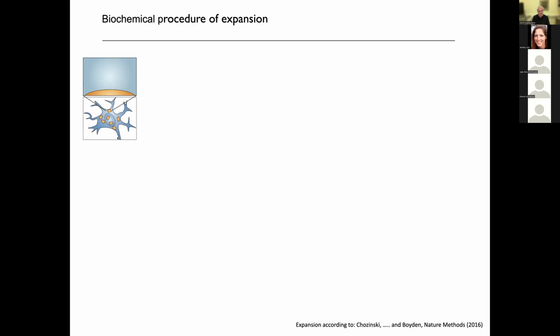So we take such a sample, and the first step of expansion microscopy is a labeling. We do that either by autofluorescent proteins, by dyes like Hoechst, or by antibodies in normal preparational approaches. So we achieve a sample which is then looking like that. In this example, we use immunofluorescence. And we see that these fluorescent antibodies are then located in the sample after permeabilization of the sample.